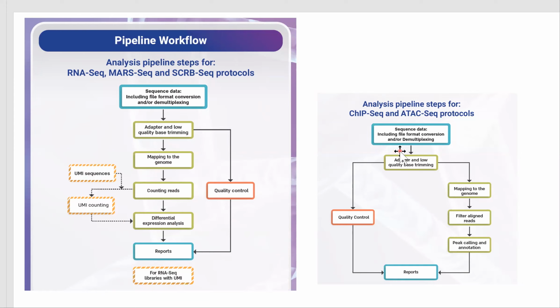We also support epigenome pipelines for ChIP-seq and ATAC-seq, starting from the genomic fragments and mapping them to the genome, calling peaks, and again, ending with the reports with also quality control information.